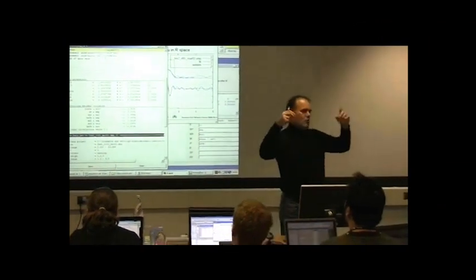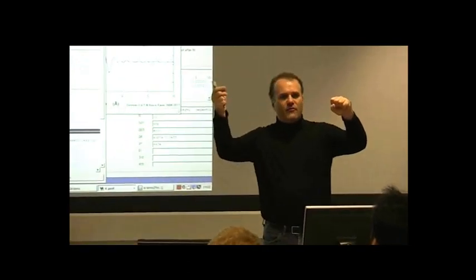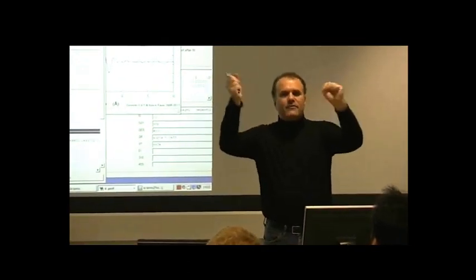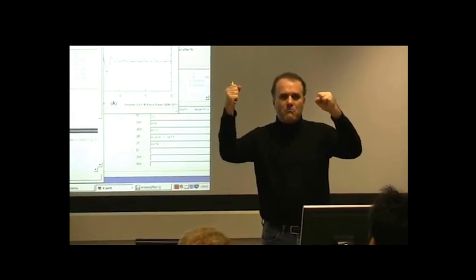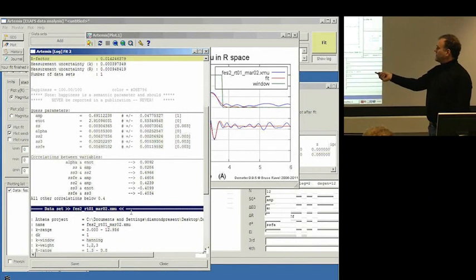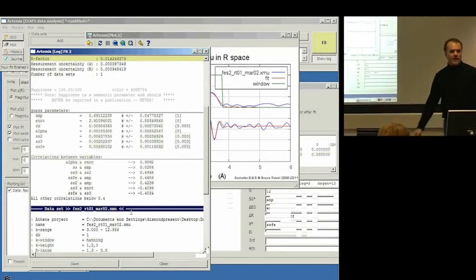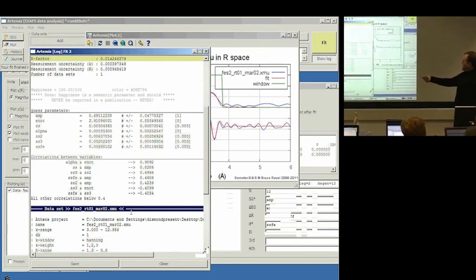whatever is holding together the iron atom and the third coordination sulfur, whatever chemistry is holding those 2 atoms together, it doesn't make a lot of sense to me that they're held together more tightly than the thing that the iron actually has a chemical bond with. Doesn't make sense that this number should be smaller than that number. But at least it's not negative. Well, it is negative. It's consistent with a negative number. SS3 is not actually positive definite, and it's oddly small.